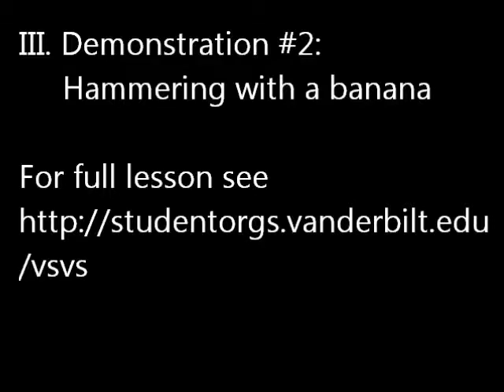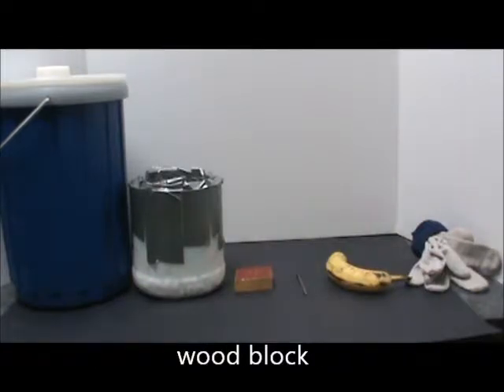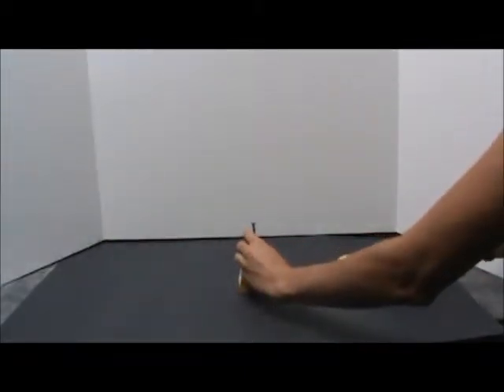Demonstration 2: Hammering with a banana. For this demonstration you will need the large dewar of liquid nitrogen, a small dewar, a wood block, a nail, a banana, and gloves. Attempt to hammer the nail into the board with a banana.